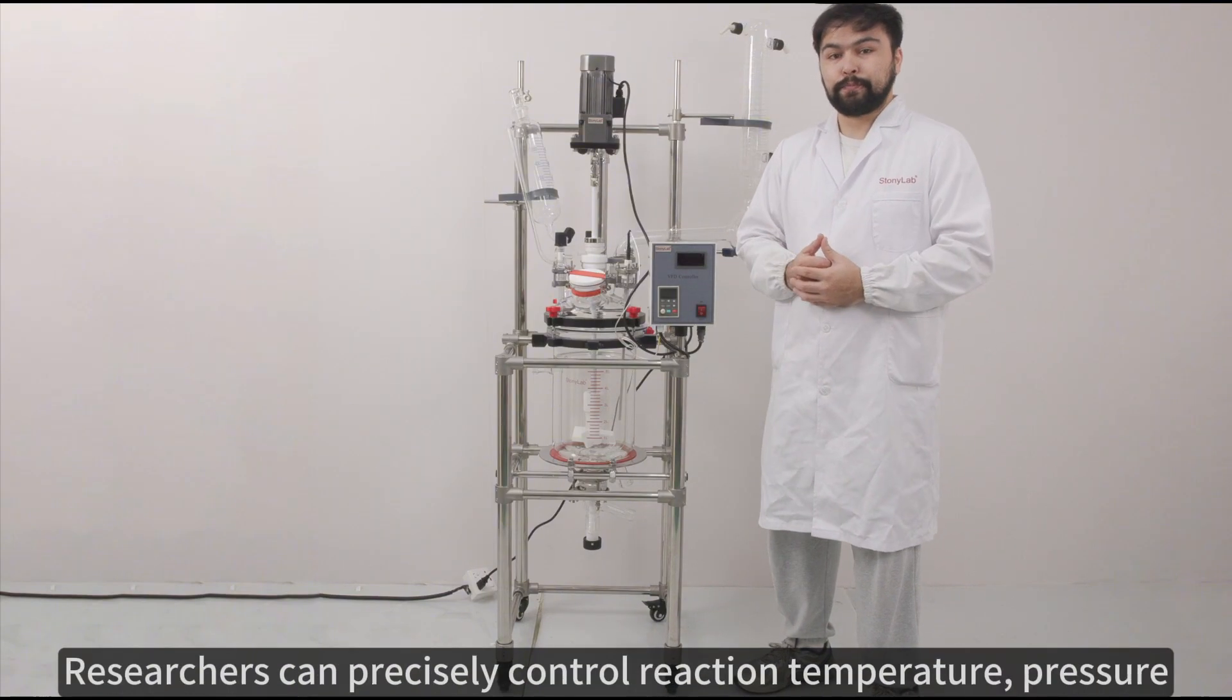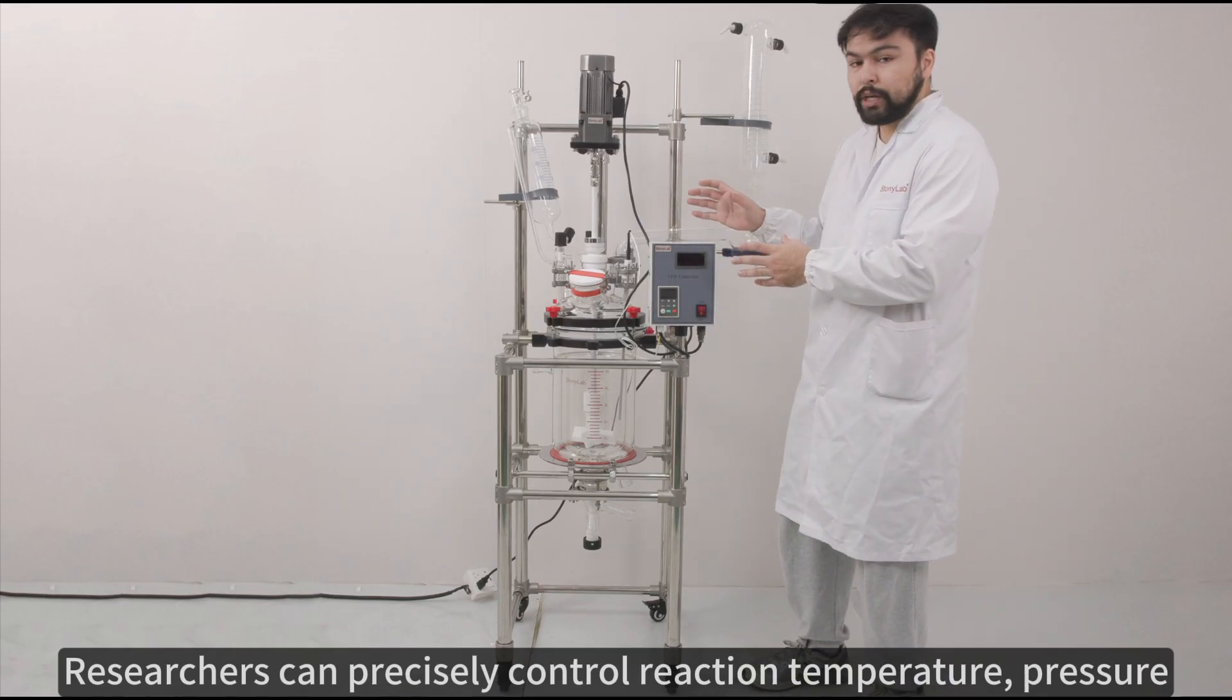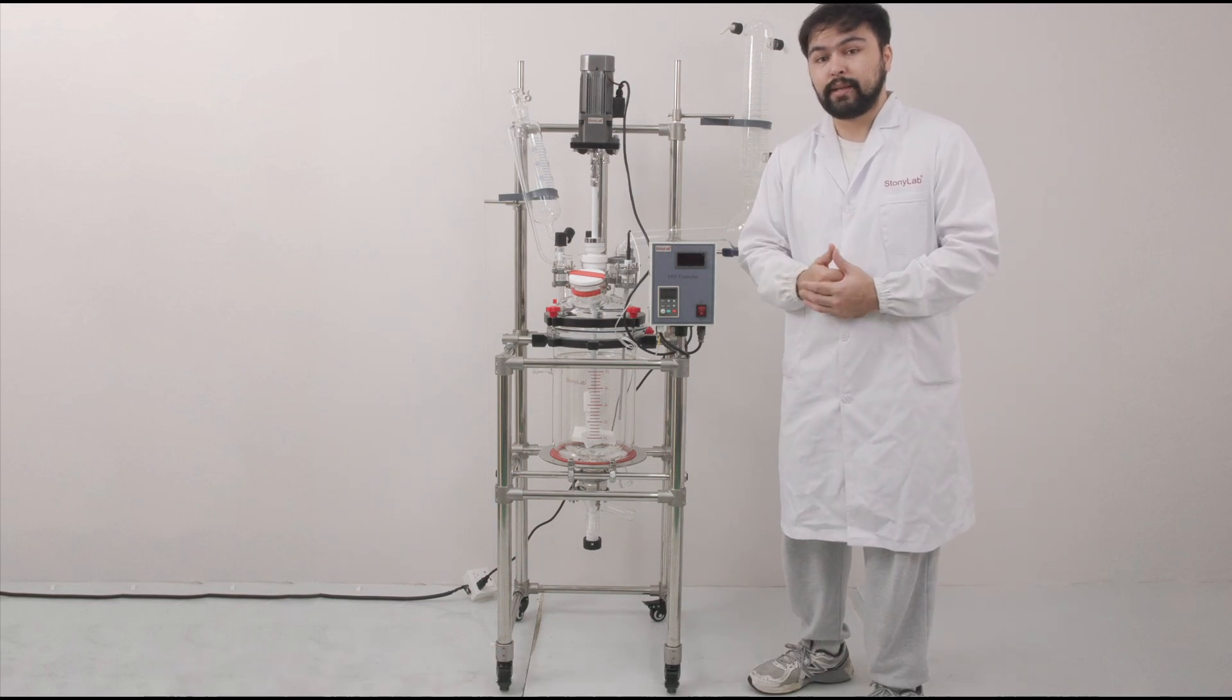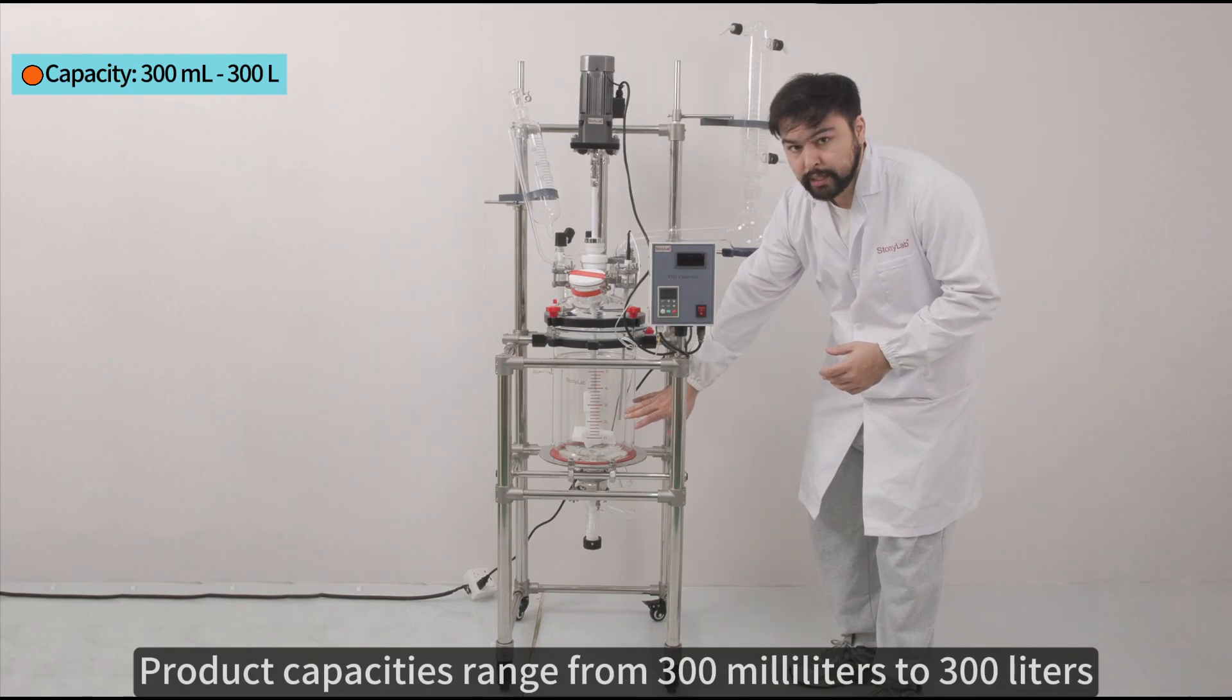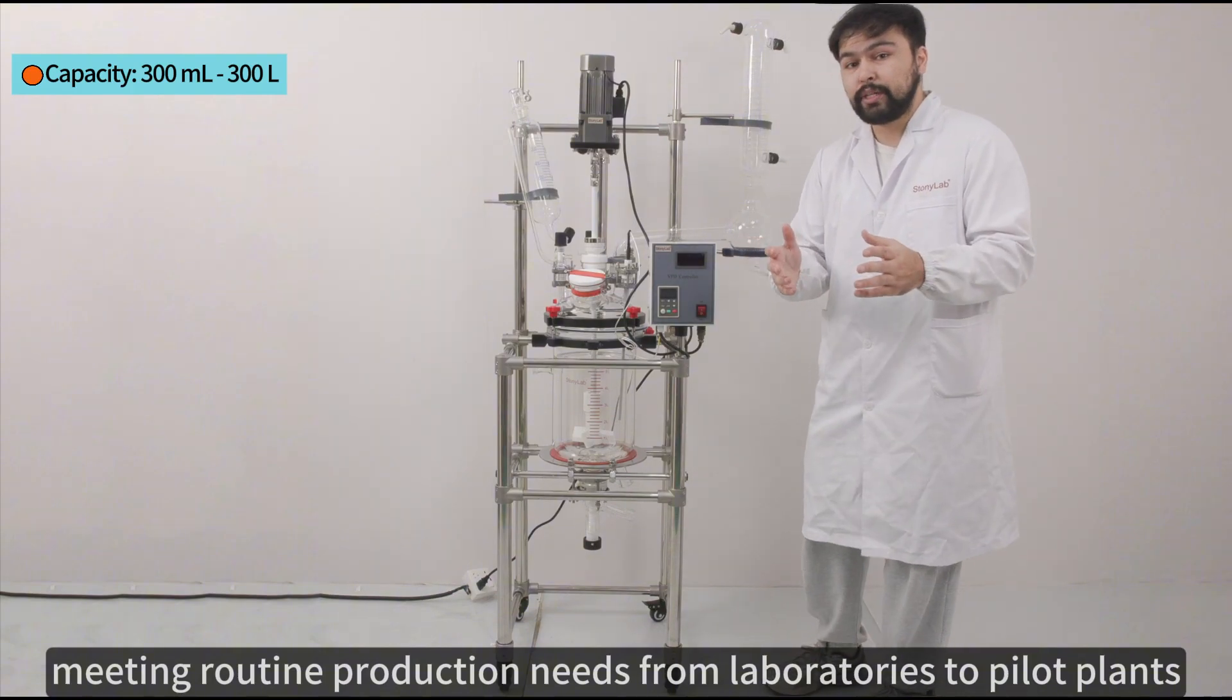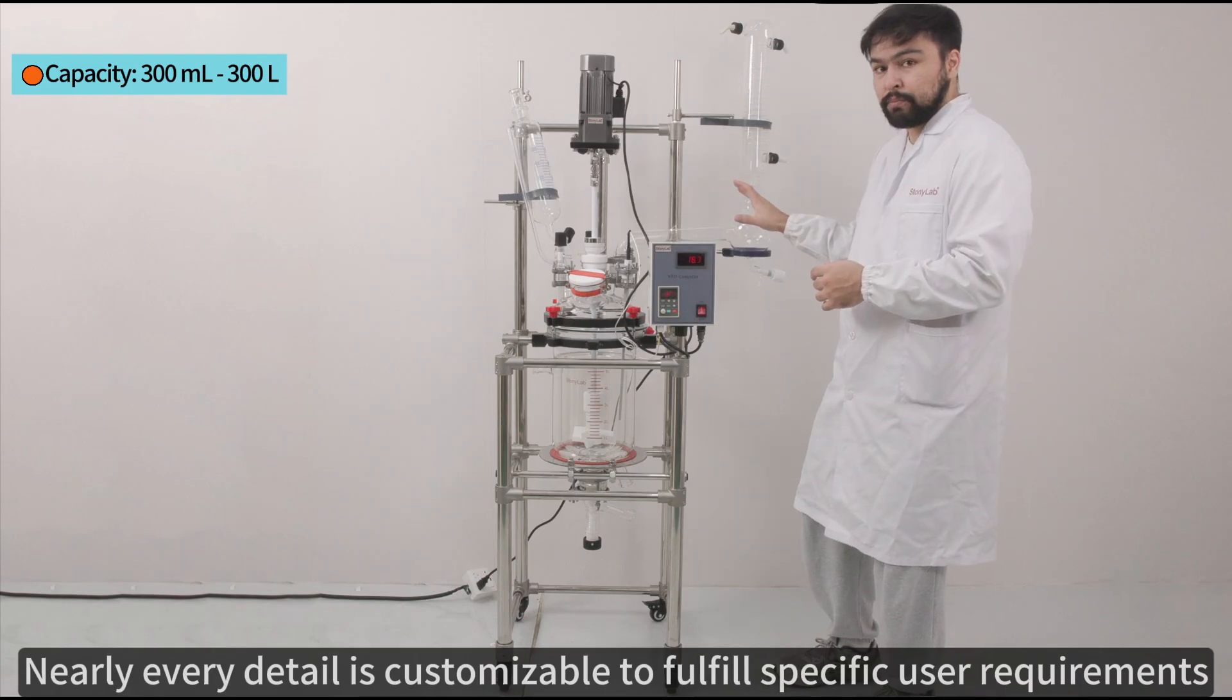Researchers can precisely control reaction temperature, pressure, and material addition to optimize the reaction process. Product capacities range from 300 milliliters to 300 liters, meeting production needs from laboratories to pilot plants. Nearly every detail is customizable to fulfill specific user requirements.